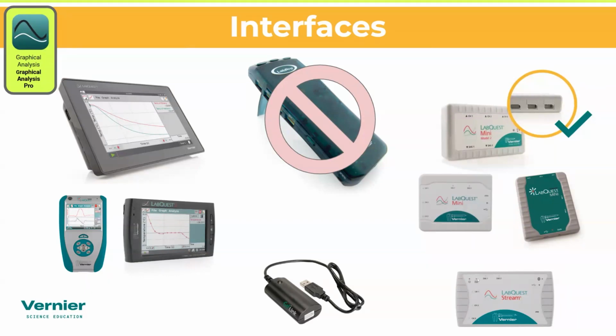LabQuest Stream was again an older interface that you could use with these as well, but you can't buy those anymore. And then the LabQuest 3 can actually be an interface with your sensors to the Graphical Analysis app. So the big change, if you're still using a Lab Pro, you will need to change your interface. That's a big piece.